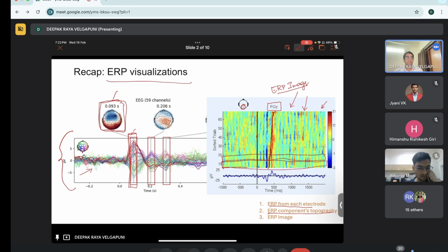And another one is to visualize trial wise time course and average in smaller number of trials, so that you get an ERP image. So these are the 3 types of ERP visualizations. We will have practice in the next later sessions. Right now we just practiced only this part, the topo plot and this, but we'll look into ERPs in the later classes.